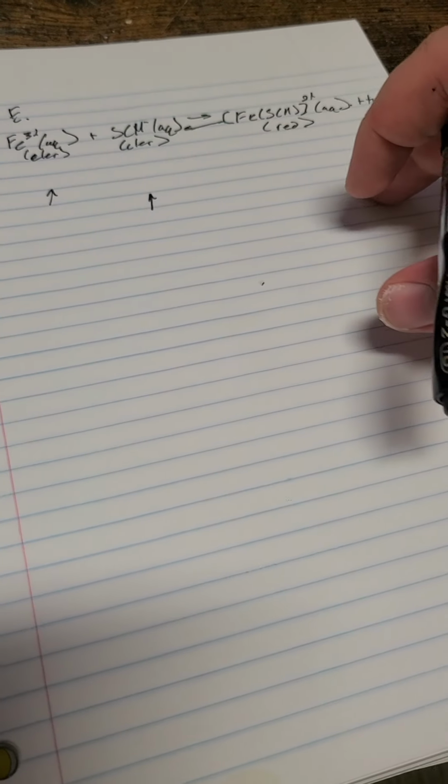When KSCN is increased, it will also cause a right shift because the reactants are increasing. It will cause an increase in products. The resulting solution is also a very dark red.